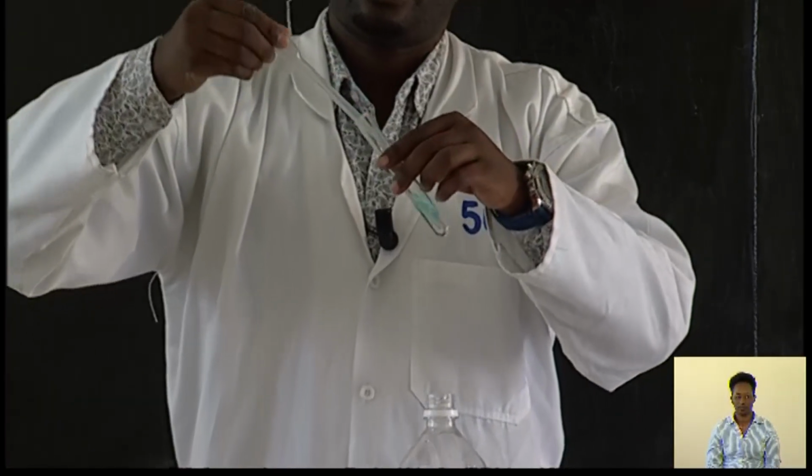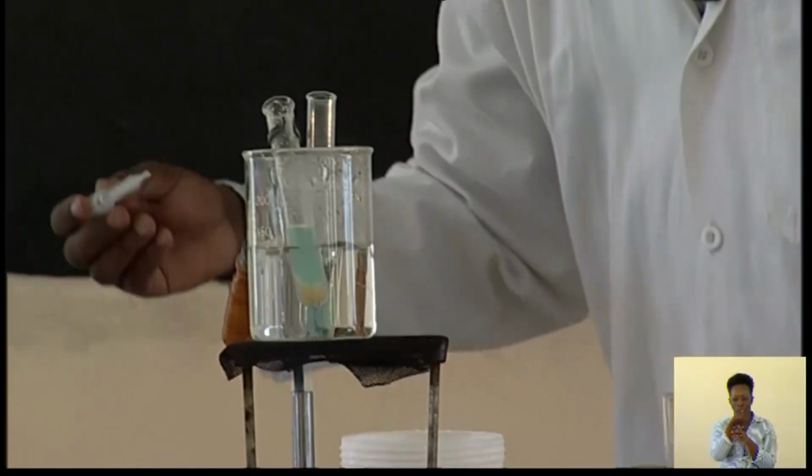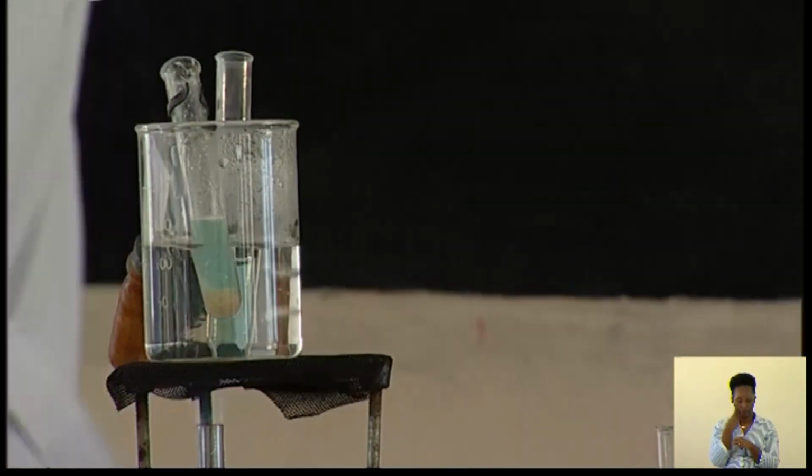Benedict's solution. You can see the Benedict's solution is blue in color. Then I also put it in boiling water, and then I try to make observation. When I'm making the observation, we have to see color changing.